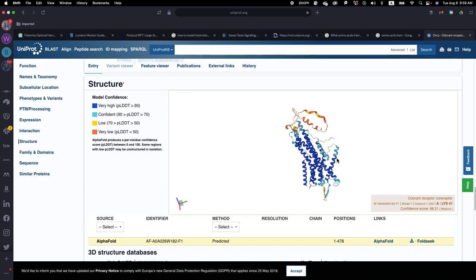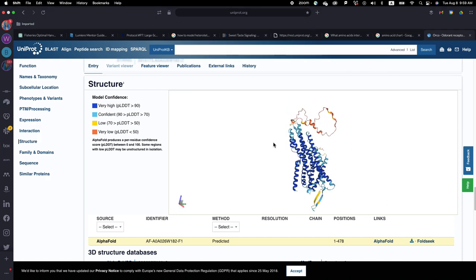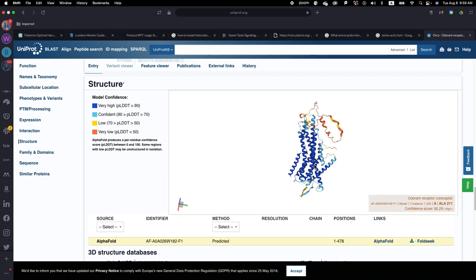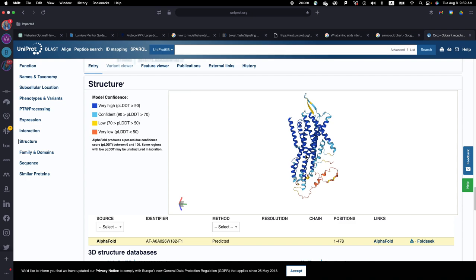Because your biggest clue is you want the helices to be up and down. You want them to be up and down because they're transmembrane. So I actually think I have it upside down. There we go. Should I download these images as well? Yeah, so you can take as many screenshots as you want and just label the screenshots appropriately, so that way you know what it is and I know what it is when I look at it.